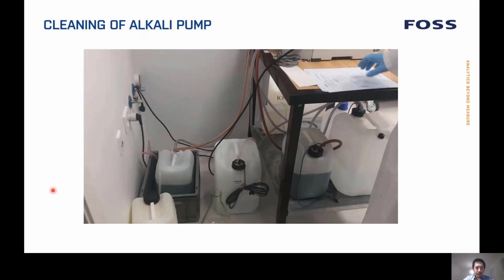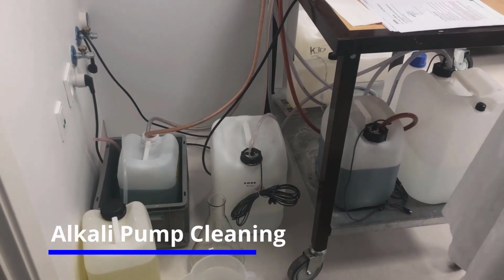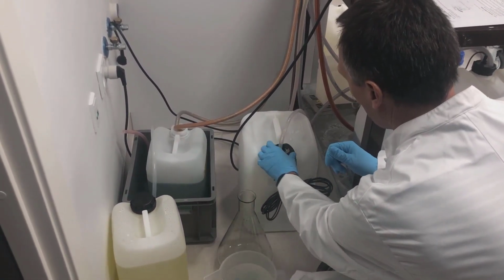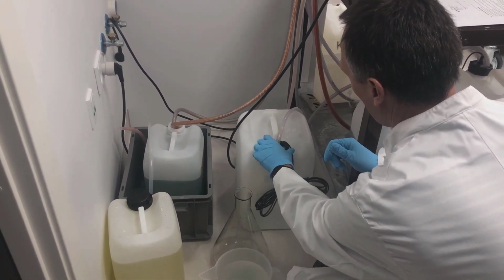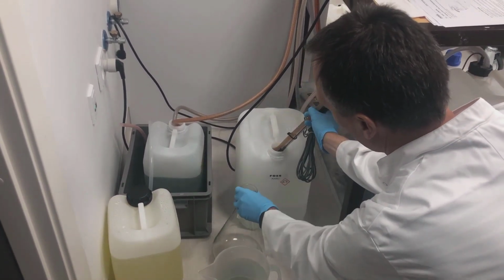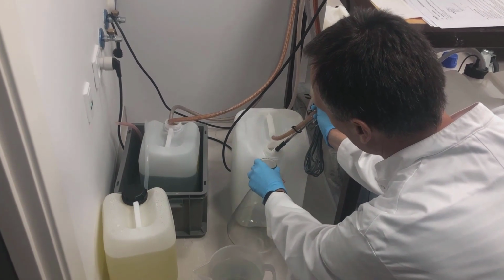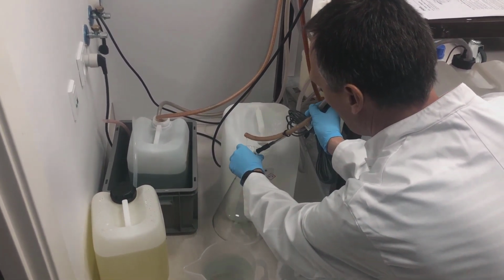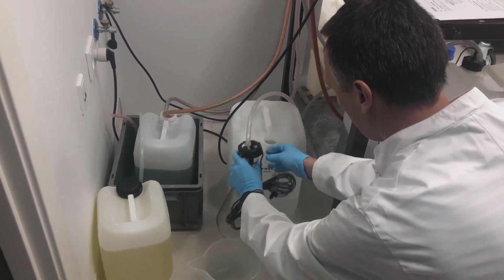Okay, next part is about cleaning of the ALKALI pump. It's almost the same procedure for the receiving solution pump, so you can follow this procedure to clean both pumps. First step is to take the tube out of the tank and place it in another flask or container, because we will drain out the remaining ALKALI in the ALKALI pump.